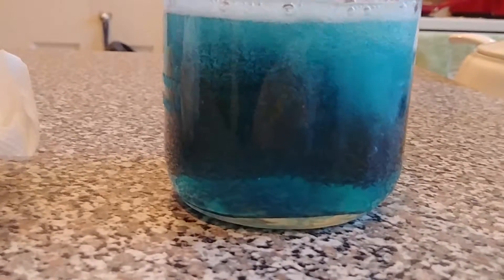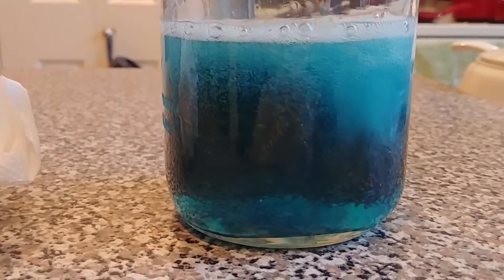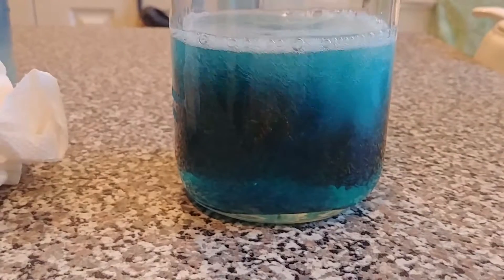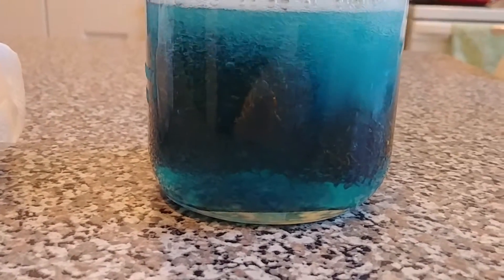This is my homemade copper acetate solution, made with acetic acid, hydrogen peroxide, and a 100% copper scrubbing pad. The whole thing almost turned white when I first put in the copper — just so many bubbles.